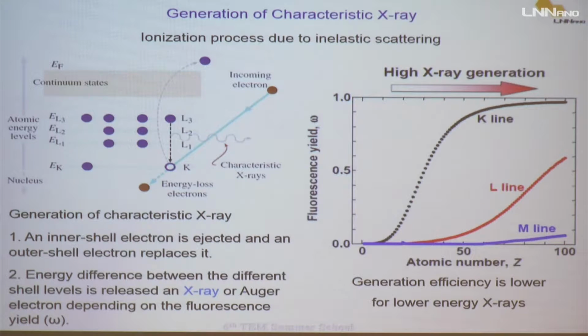But in the case of the EDS acquisition, we use exactly the same event. But we will not measure this electron that lost some energy. We will measure an indirect event that is the relaxation of the ionized atom. Let me describe this diagram first, please.